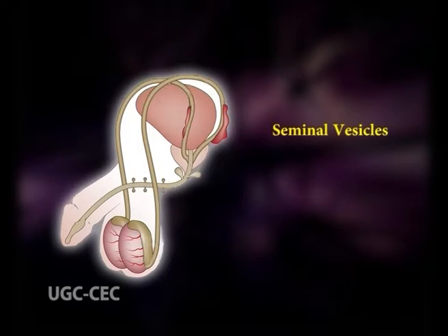Seminal vesicle. It is an androgen dependent tissue. The seminal vesicle is a sac-like mass that is really a convoluted tube. The seminal vesicles develop from the vas deferens. Their histological organization resembles to some extent that of the vas deferens.